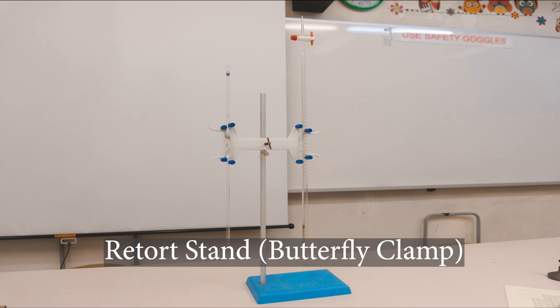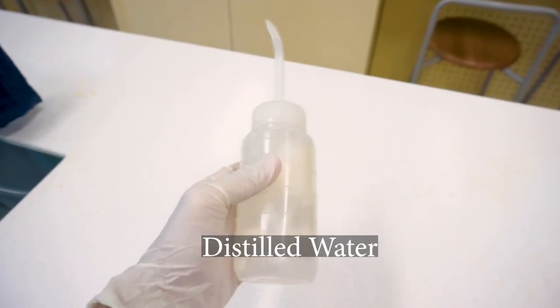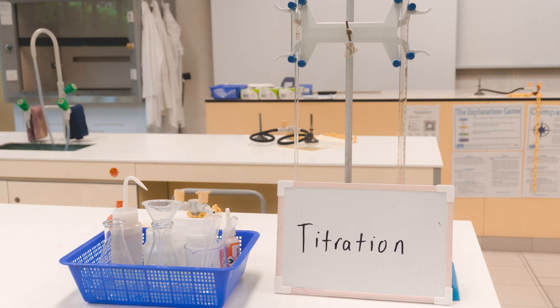A retort stand with a butterfly clamp, and finally a bottle of distilled water. Once you have all these items, you are ready to begin the process of titration.